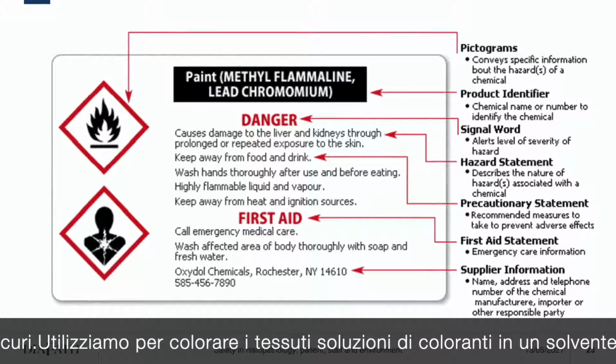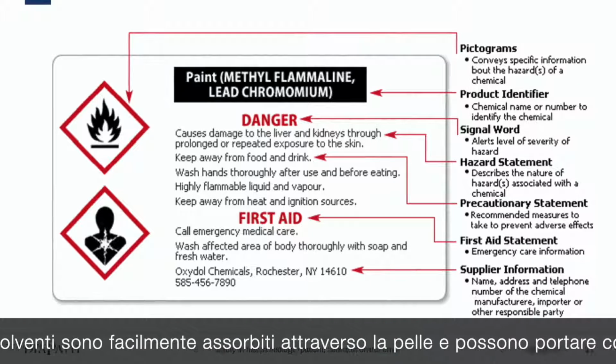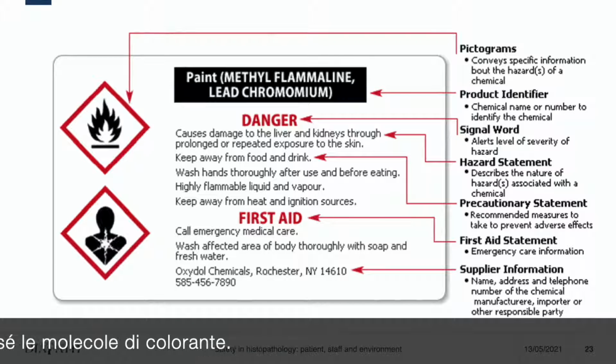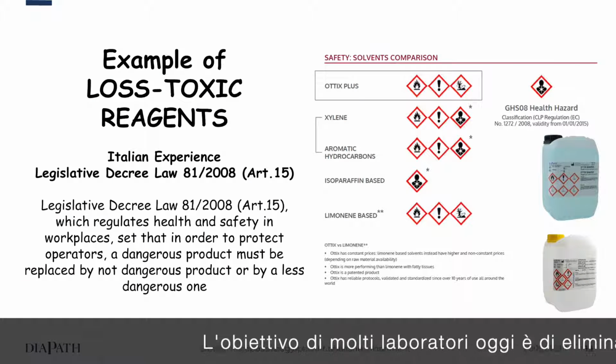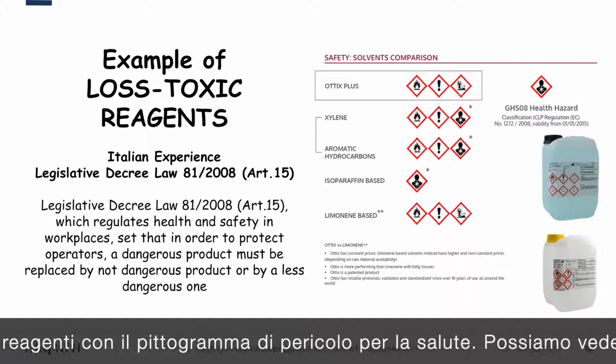This can be avoided by employing safer, ready-to-use, pre-diluted stains. Stains are solutions of dyes in a solvent. Solvents are readily absorbed through the skin and may carry dye molecules with them. The aim of many laboratories today is to eliminate reagents with a health hazard pictogram.